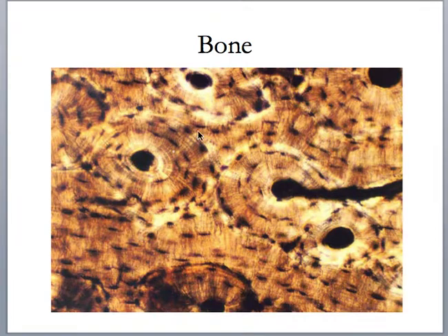So this should look familiar to you. This is compact bone, a histology slide of compact bone. And now I'm going to talk about some of the more detailed structures of compact bone.